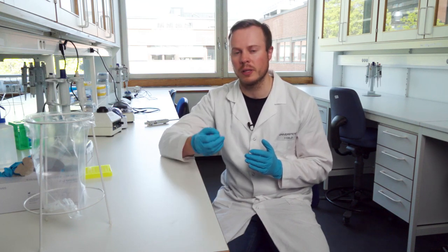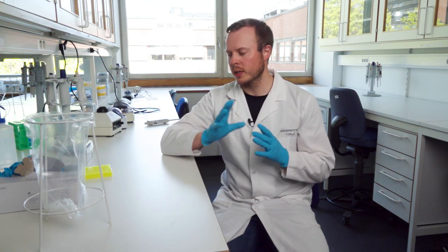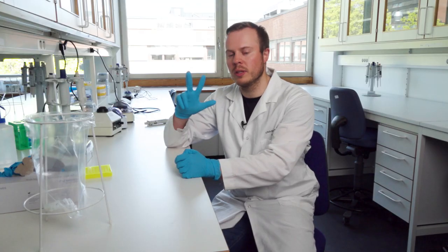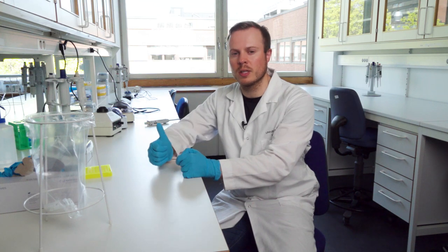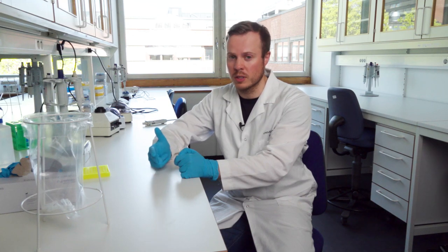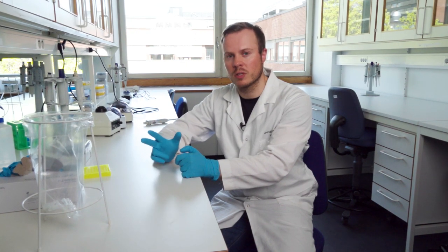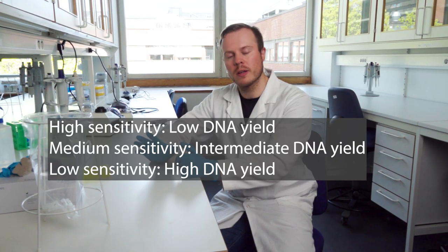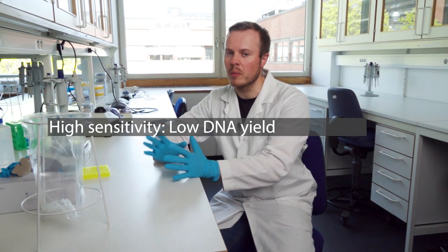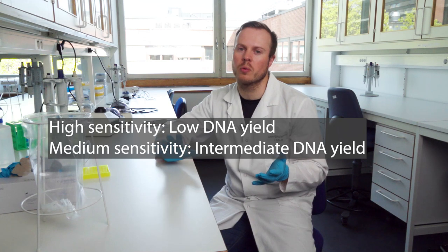So here it's very important to follow the procedure, and in the procedure you have three different ways of doing it. The first way is the high sensitivity, you have a medium sensitivity, and you have a low sensitivity. These are specialized for different amounts of DNA in your sample. For example, you can use the high sensitivity to quantify samples that have low amounts of DNA, and then the medium range, which is the one I think fits most of the samples we are working with right now.